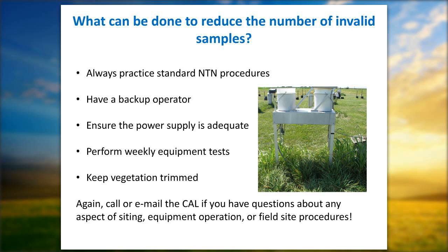Completeness criteria, the second most tedious slide in this presentation. We're not going to spend as much time as we did on the sample flags, but basically, this is the time of year when we are mailing out the summaries from 2013. We've prepared the maps, and you may come to it and say, well, hey, where's my site? Well, NADP runs by a scientific committee, and they've established 3 criteria for evaluating the validity of a site.